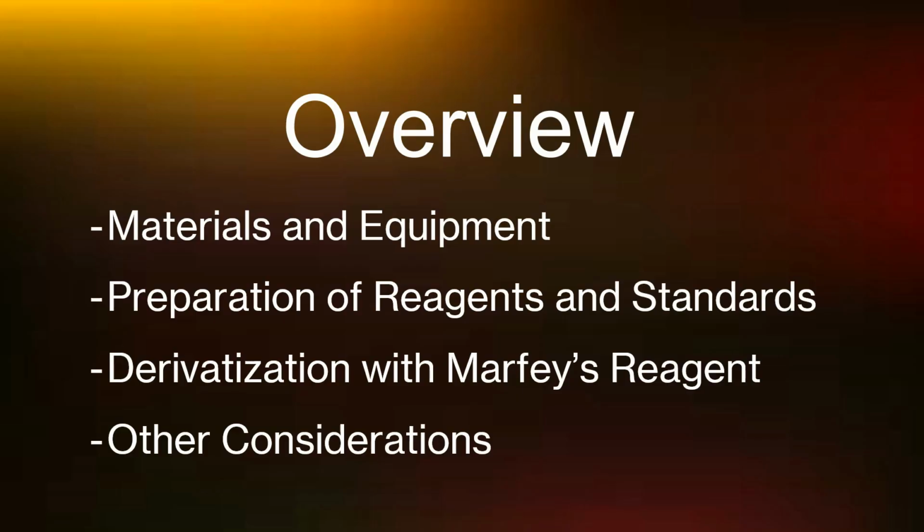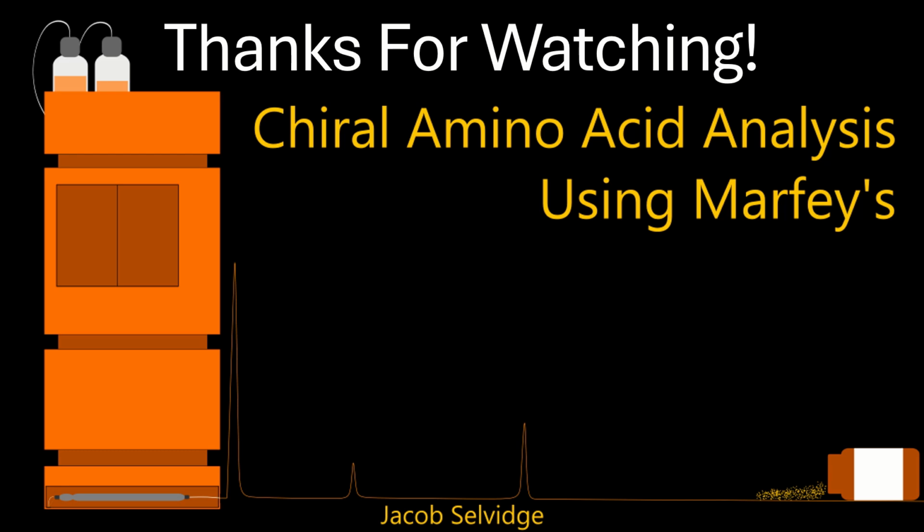With that, we've covered what is needed, how to prepare our samples, how to derivatize, as well as some potential stumbling blocks to keep in mind. You're all set to begin running with your HPLC.